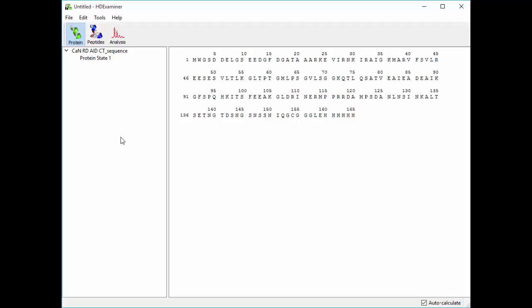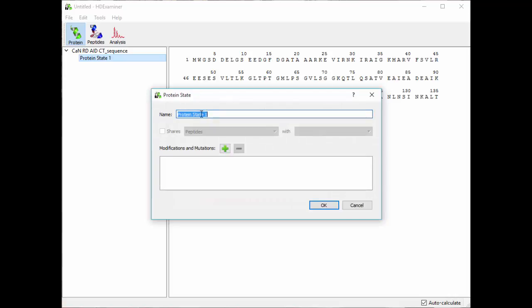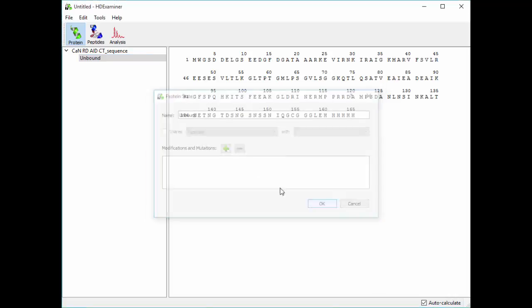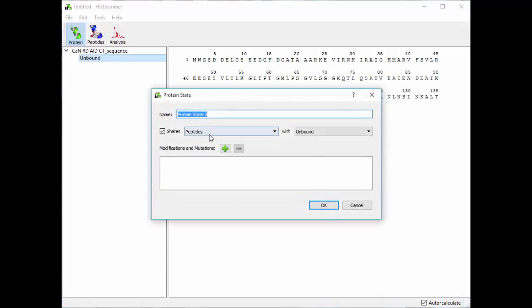HDExaminer supports this with the use of protein states that you set up here in the protein view. So by default, a project contains a single protein state called protein state 1. Since this is a ligand binding experiment, I want to actually make two protein states. So I'm going to first edit this one by selecting Edit Protein State, and this one is going to be called Unbound. And then I'm going to right click again, select Add Protein State, and call this one Bound.